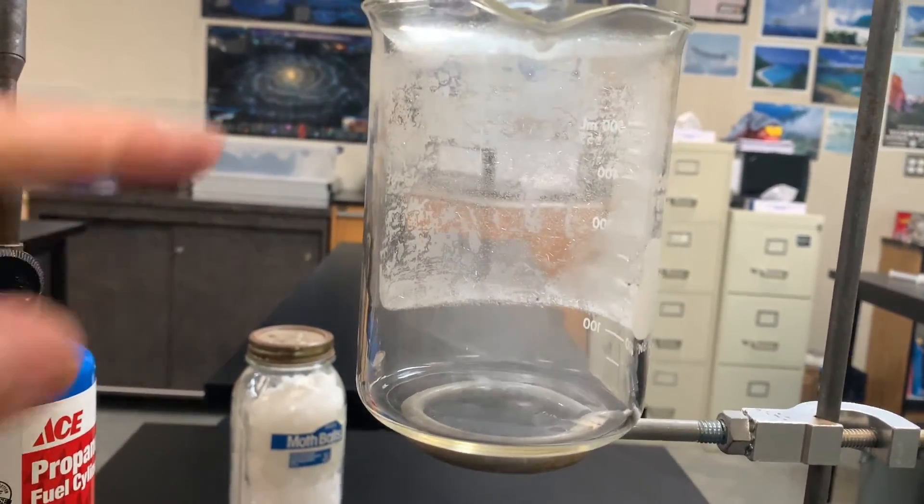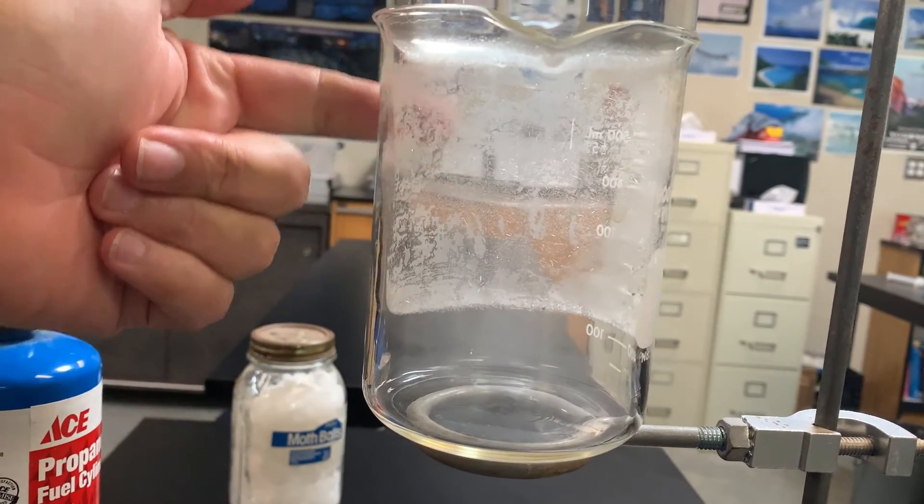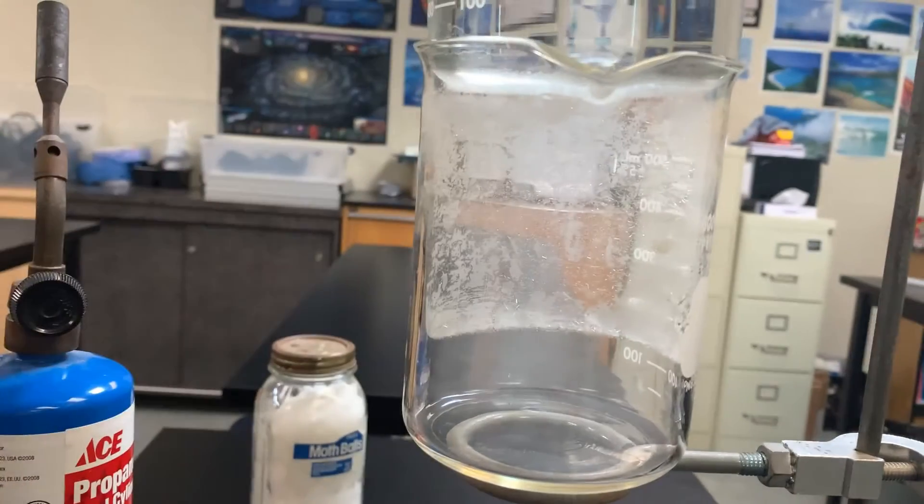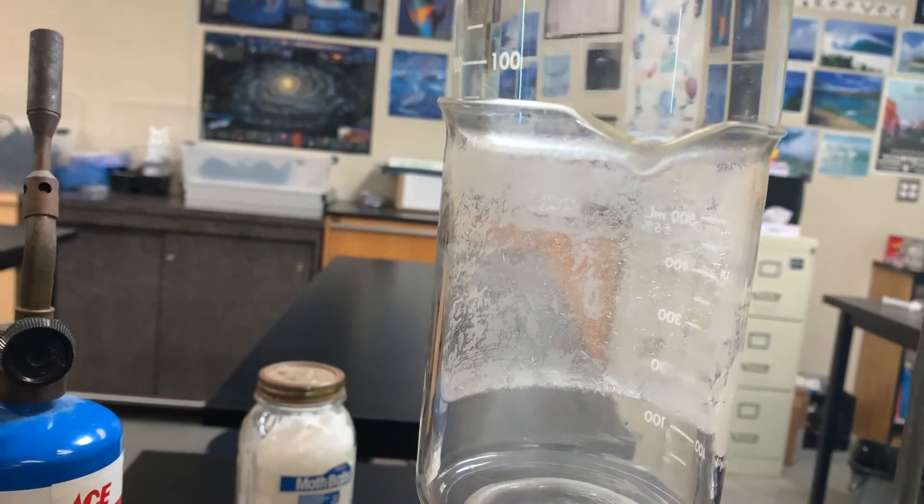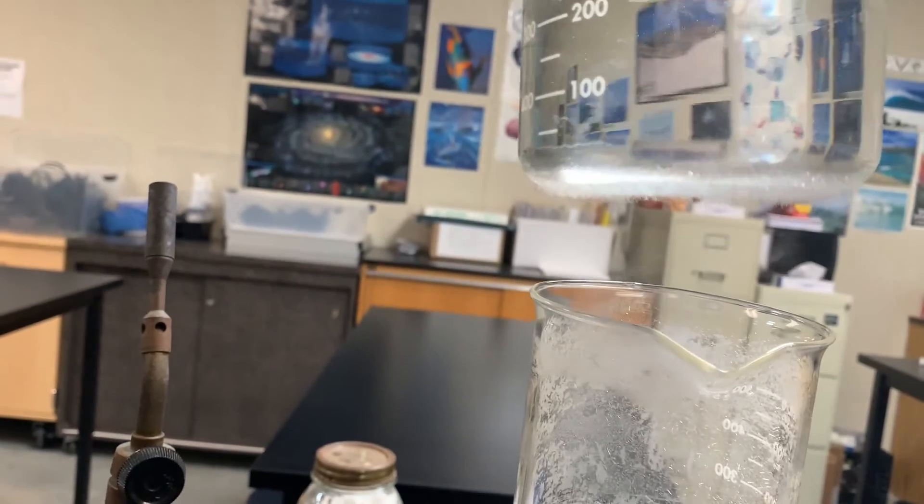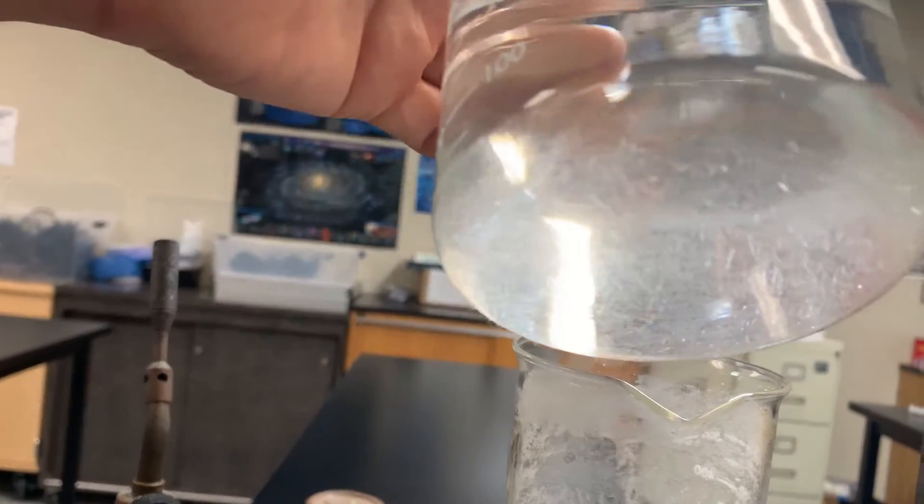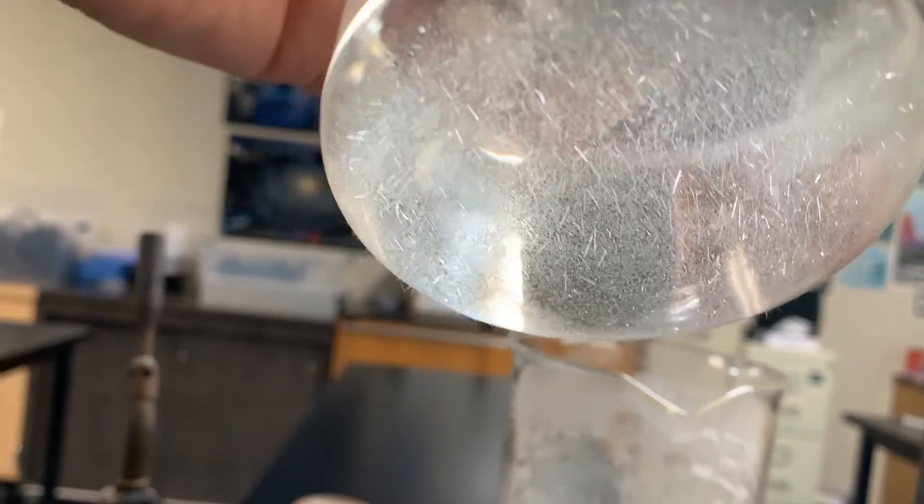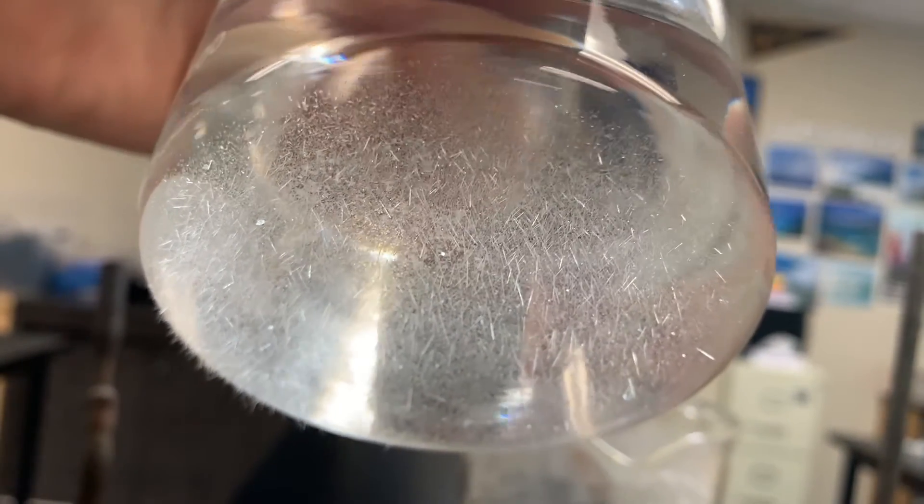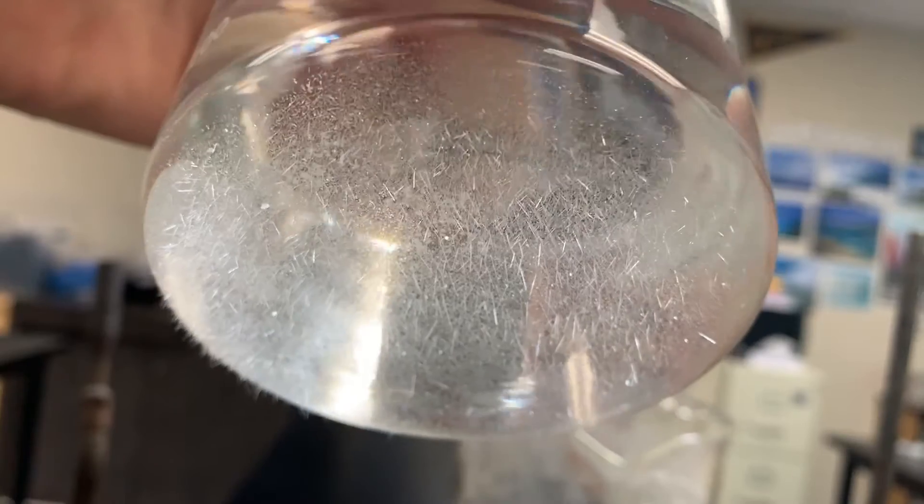But what I do see, what you can kind of see in the back here, there's a lot of crystals that have formed on the walls of the container. And especially when I lift up this beaker and I show you underneath here, it's really cool. You can see these awesome little crystals on the bottom right there. They're just like kind of long little fingers. They look like sharp little needles.